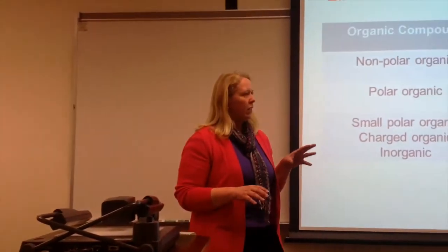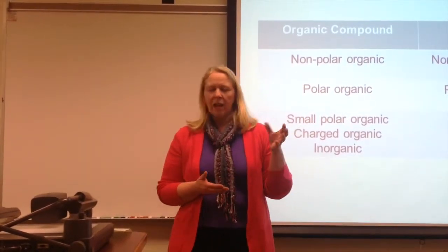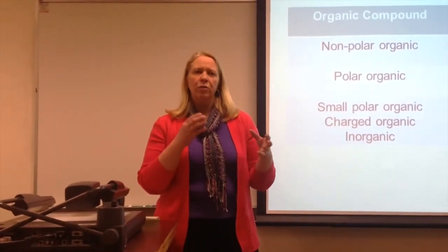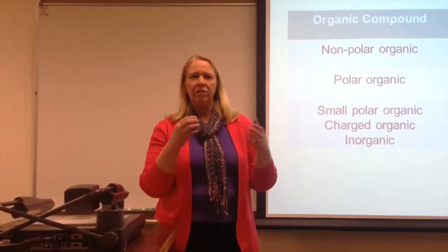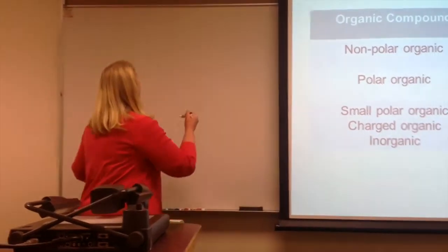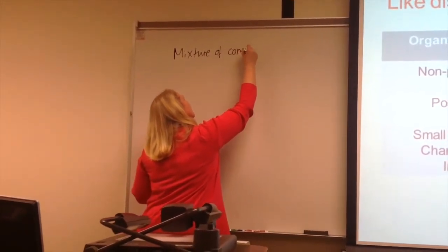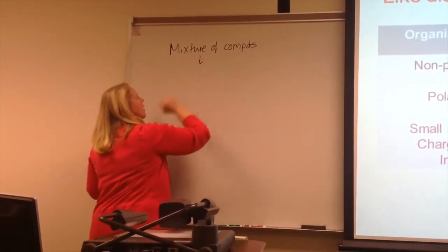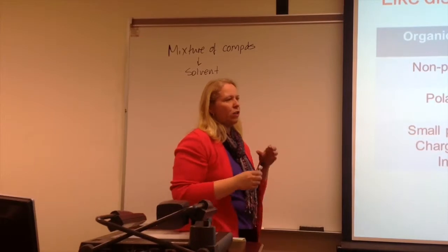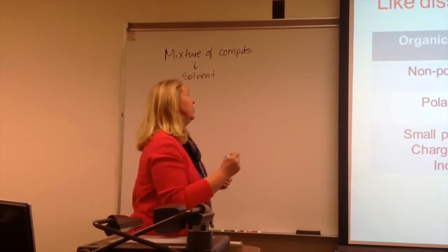So for the liquid-liquid extractions, an extraction is really the separation of a mixture of compounds, and as the word implies, liquid-liquid, we're using different solvents to differentially dissolve the compounds into one or the other, right? So how we're going to start out is by taking a mixture of compounds, and we're going to dissolve those in a solvent, and then we're going to try to pull one specific compound at a time selectively into another solvent.